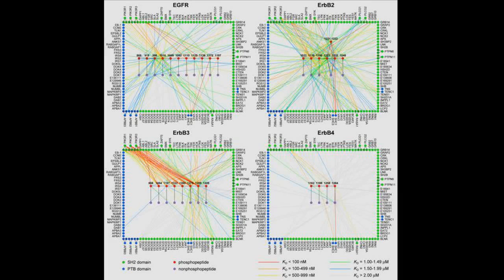And we used these affinity maps to characterize each growth factor receptor: the epidermal growth factor receptor, also known as ERBB1, in the top left, ERBB2 in the top right, which is today typically known as HER2, and ERBB3 at the bottom left, which really recruited the phosphoinositide kinases really well. Those were all depicted in red.